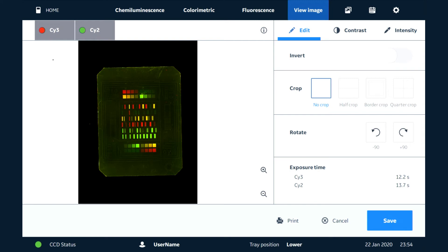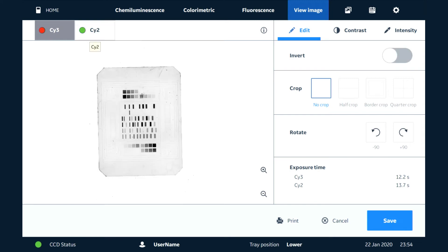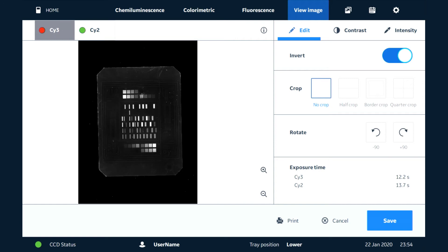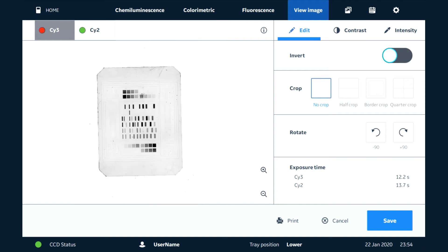Then we can look at each channel in turn. Let's say we want to look at the Cy3 channel. We have the option to invert that. We can do some editing by cropping the area or rotating.